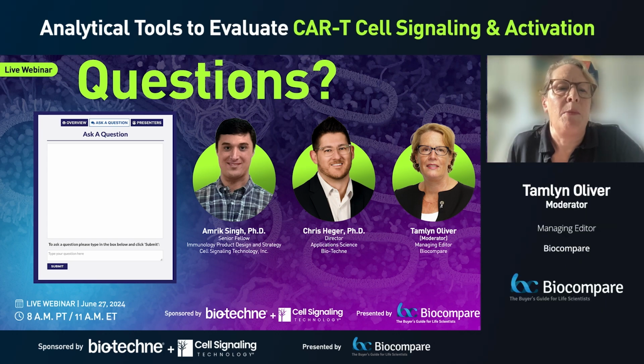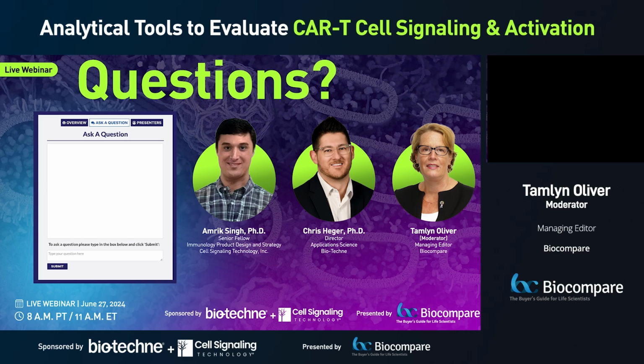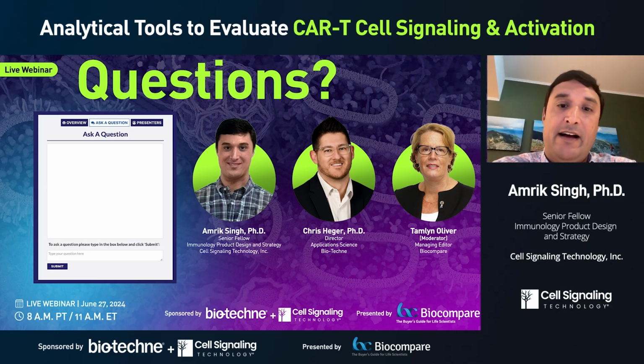Thank you. How to quantify the purity of CAR plus cells? Is there a kit available for doing this? Great question. Actually, it's a very timely question. Cell Signaling Technology just recently commercialized 2 kits that involve bead-based enrichment of scFv-based CARs containing either G4S or Whitlow linker.